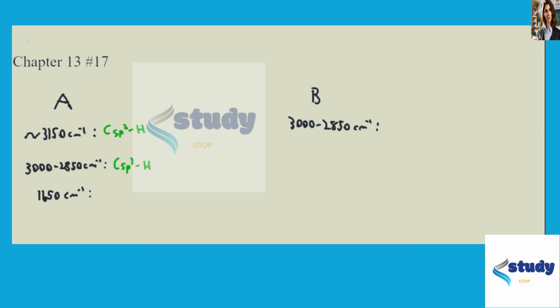That is due to the carbon-carbon double bond that we know must be present because we have a C(sp2) hybridized carbon-hydrogen bond. So I guess a carbon-carbon double bond doesn't have to be present, but carbon is certainly doubly bound to something. And we know that, again, because of this first peak that we assessed here.